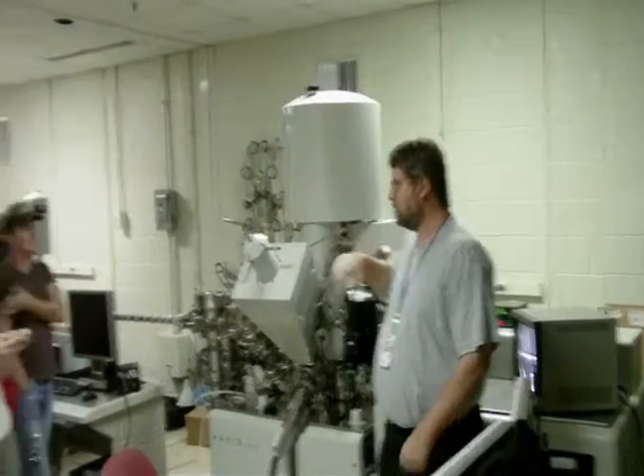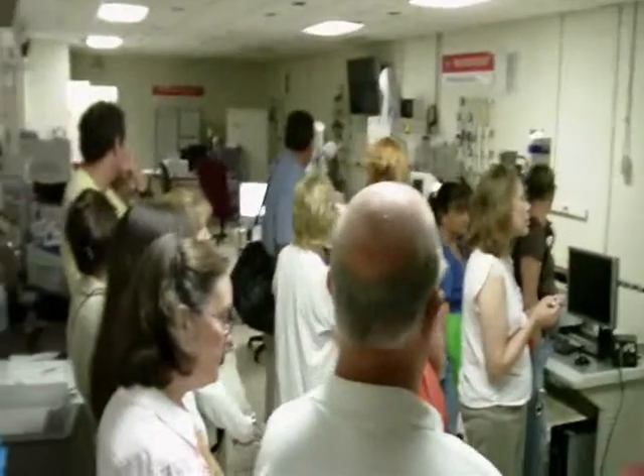The electron microscopes that we use work a little bit differently. Instead of having an x-ray beam, we have electron beams.